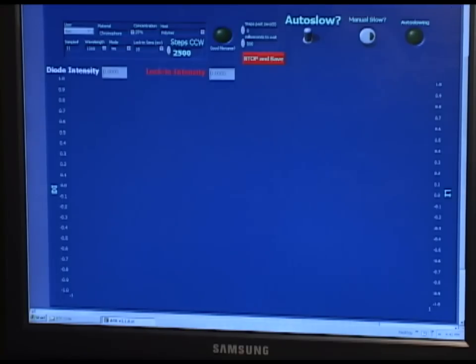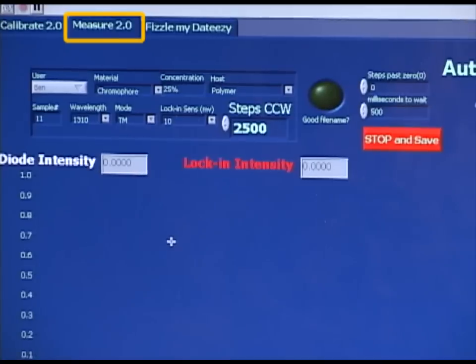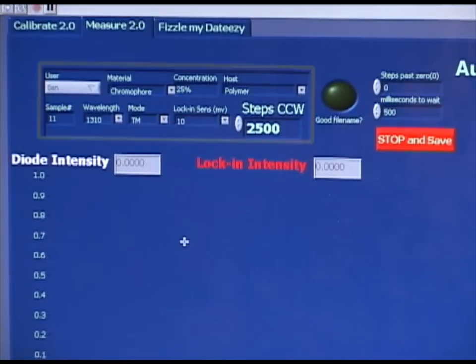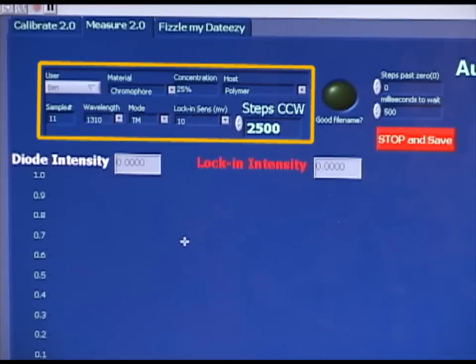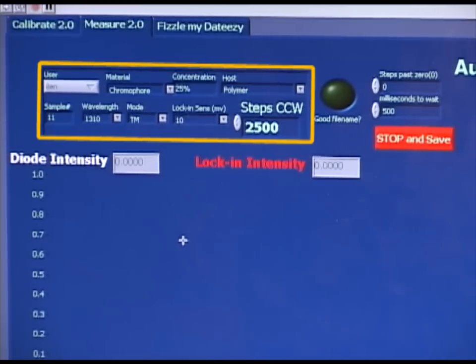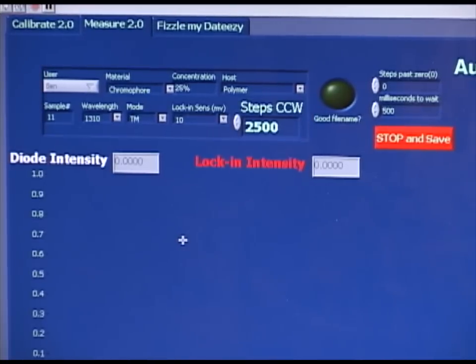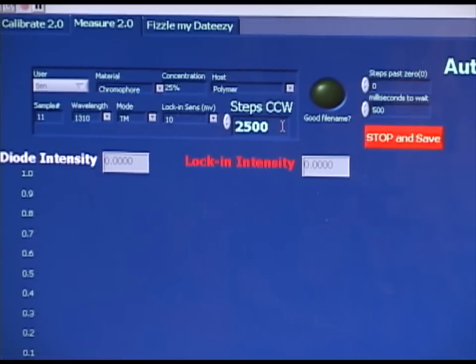Now that the sample has been calibrated and properly zeroed, we can begin measuring. To do this, we click on the Measurement 2.0 tab in the program and in the upper left-hand corner, we will see an informational box where we can put in the username, the chromophore material used, the host polymer, concentration, sample number, and the lock-in sensitivity used. This information will be attached to the data we take during measurement and stored on the computer as an electronic notebook.